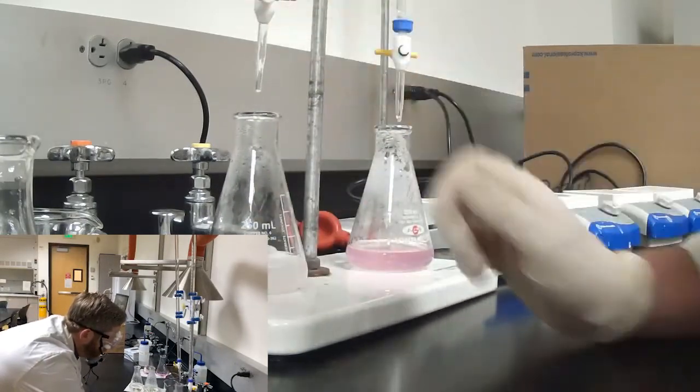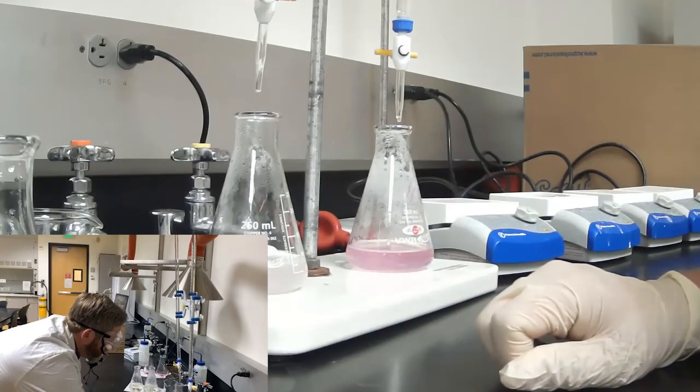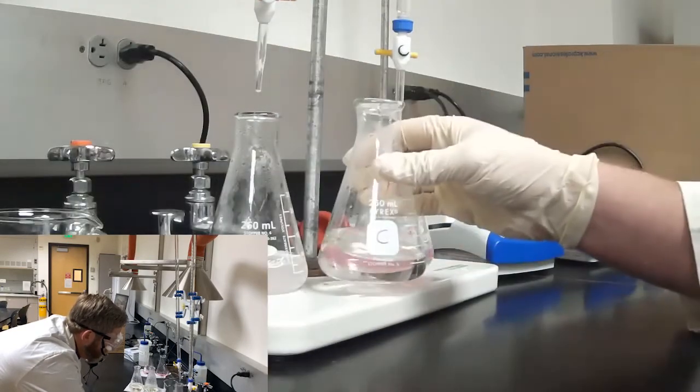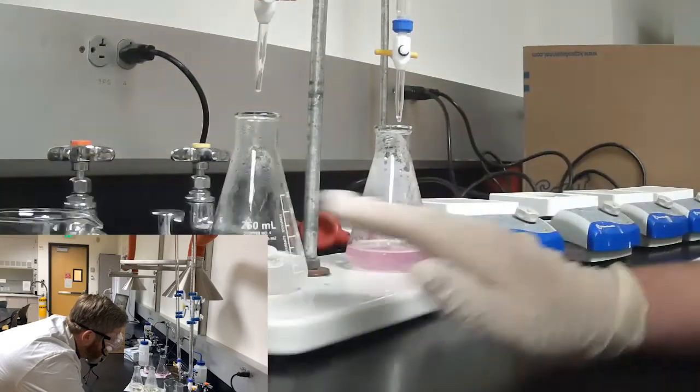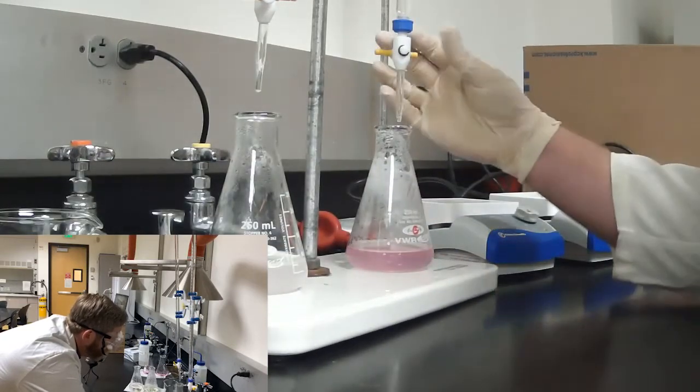And because this is a different kind of agent and we don't know exactly the composition of our TUMS tablet, we're going to be meticulous in making our measurements. And I'll shut up so we can speed this up.